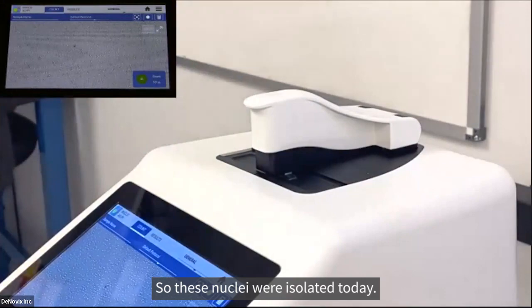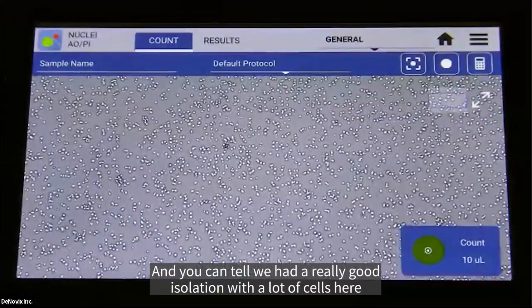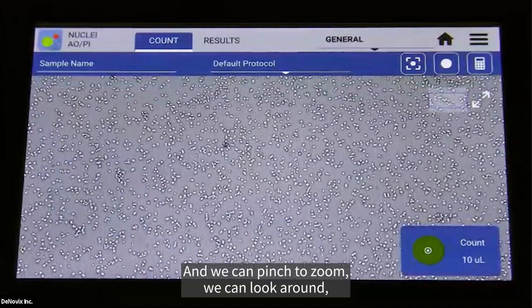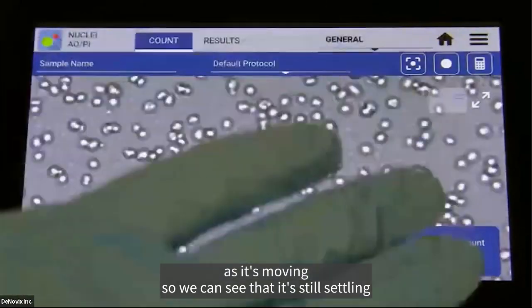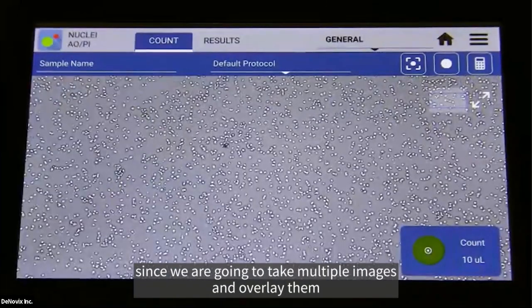So these nuclei were isolated today, and you can tell we had a really good isolation. We have a lot of nuclei, excuse me, on the screen here. And we can pinch to zoom, we can look around, we can just check on the sample as it's moving. So we can see that it's still settling, and we want to give it a few seconds to do that since we are going to take multiple images and overlay them.